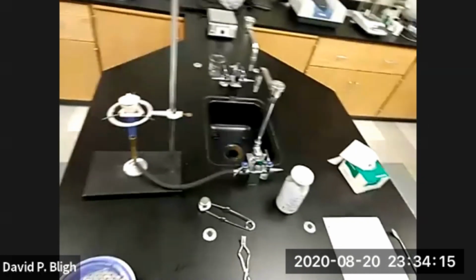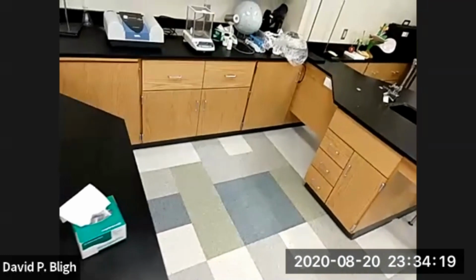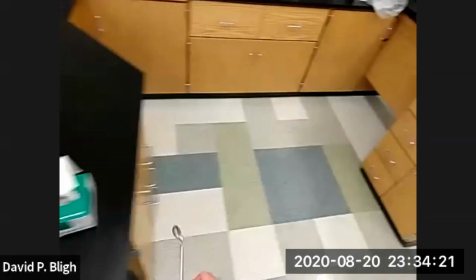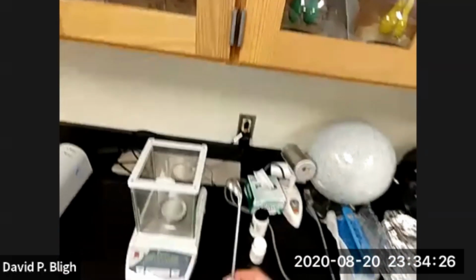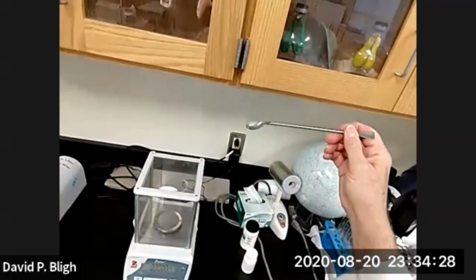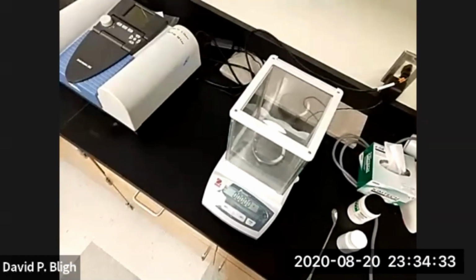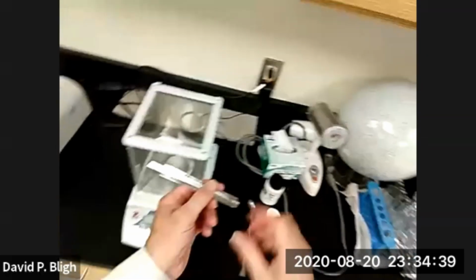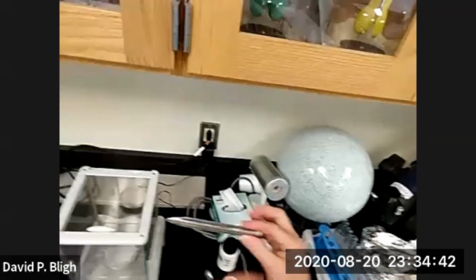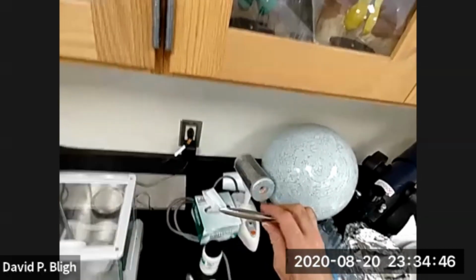All right, we're still waiting. So you will also need a spatula. This just has a special name. It's called a spoonula, right? Because it looks like a spoon. The kind of spatula that you normally would use would be, let's see, let me pull one out. This is actually a spatula. Yeah. It has a fat end and a narrow end. The narrow end is good for measuring out small amounts, right?